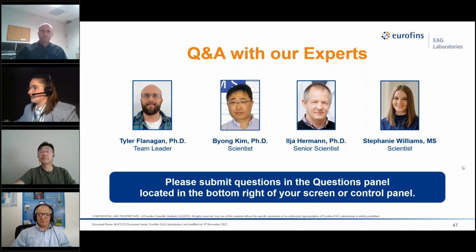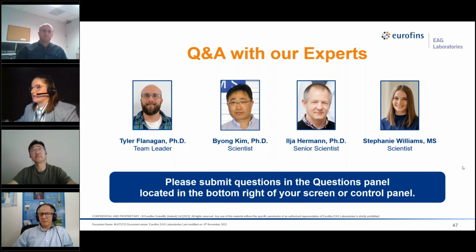Could nanoindentation be used to quantify the thickness of a soft polymeric coating on the surface of a polymeric substrate? Well, it could be done indirectly. It's not the ideal method to do so, but the idea is the following. We can, for example, wear the sample through. So it's like a wear test, scanning wear test.